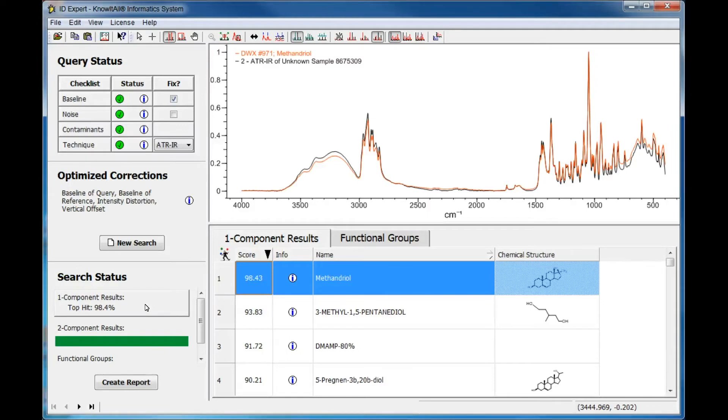As you can see, after making these corrections, you get a great match. Let's try another one.